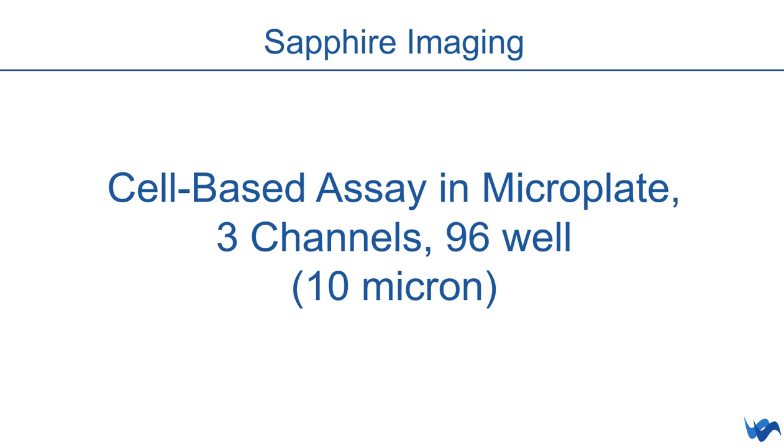And now I would like to talk about a second type of array imaging, which is very popular in the field: cell-based assays in microplates. So at the end, it's like a Western blot. We are just doing this directly in your cells. Very popular in the field, and I think in the upcoming years, this will become more and more interesting, and more people will do this because it's very convenient to do.